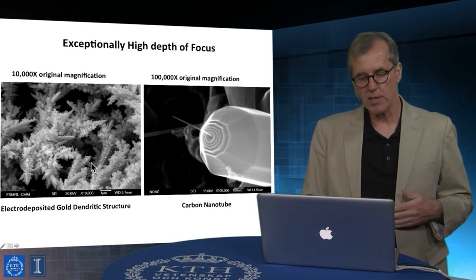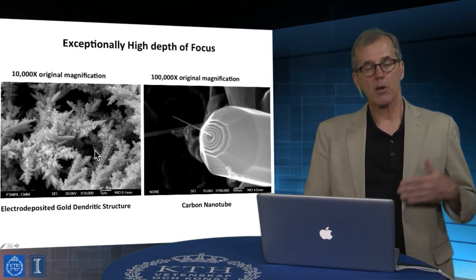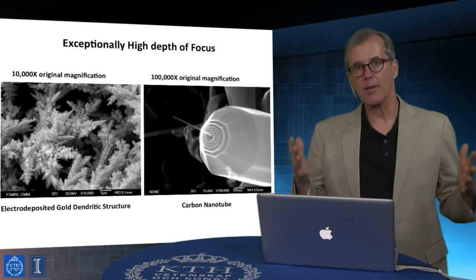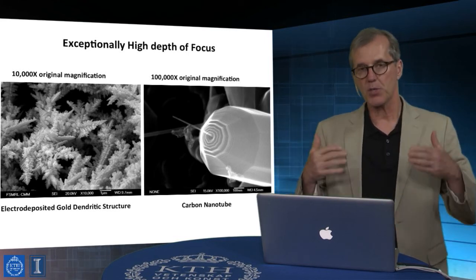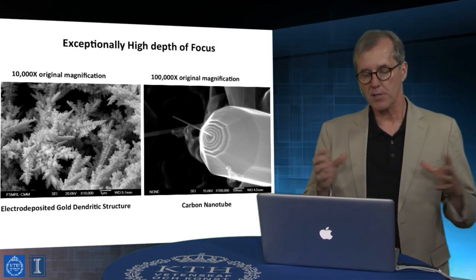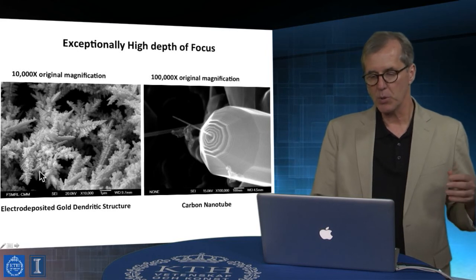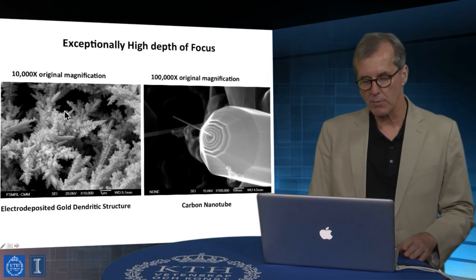And in those cases, the growth occurs via what's called fractal-like growth. When we do deposition at diffusion limited velocities, you get fractal-like structures, and dendrites are just beautiful outcomes of that kind of diffusion limited growth.